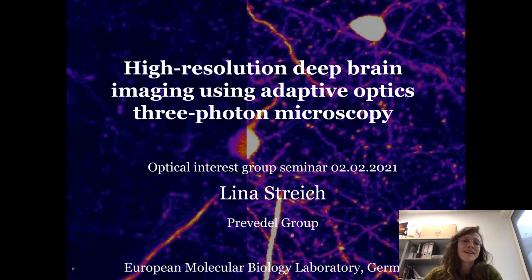And as Robert mentioned, I did my PhD in his group, and I will present the work of the last 4 years where I developed the three-photon microscope in combination with adaptive optics to enable really high resolution imaging deep in the brain.